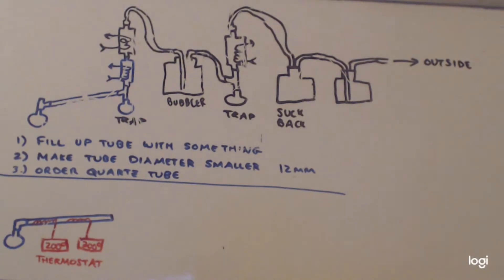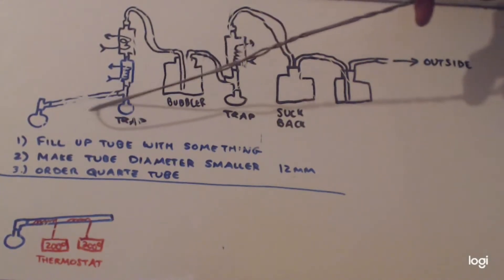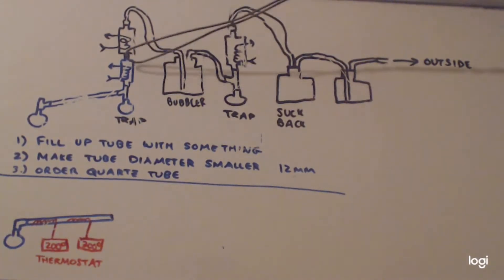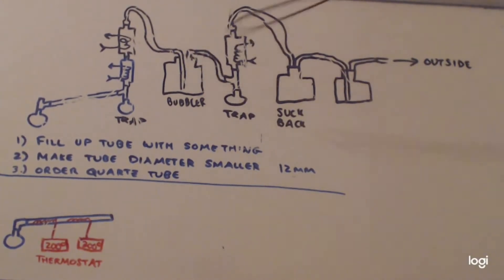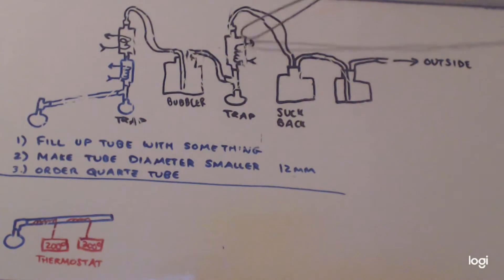I should have done this in the first video, part one, but I didn't, so I'm going to do it now. In the first video, the apparatus was just so big you couldn't see it all in one shot, but here you can. This is actually what the apparatus I used was. It was distillation over here — you can see I had the ethanol in here, this was the furnace tube that I had the heat tape around. I'd boil the ethanol, it would come off, be condensed, and go into this trap. The ethanol was high boiling enough where it would get caught here, but the rest would come out here. I should have had a suck back trap here, but I didn't. It went into this bubbler that was full of vodka that was chilled, and that's where pretty much all of the product got stuck.